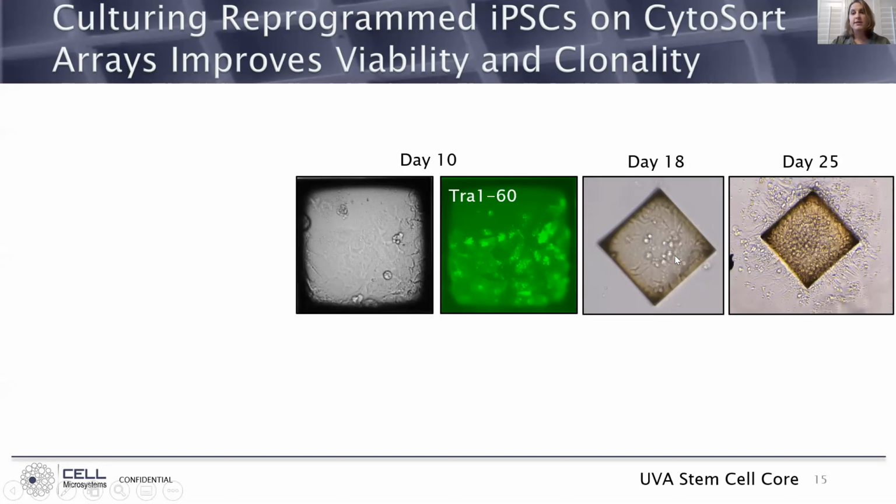We had to pick these rafts earlier than the 21-day time frame recommended by the protocol because they were already confluent and ready to go. So you can see here the raft has been transferred to a new collection plate, and in as little as a week, we're already seeing happy, healthy cells growing off the raft onto the floor of the new collection plate. So we're already seeing advantages in terms of usability.